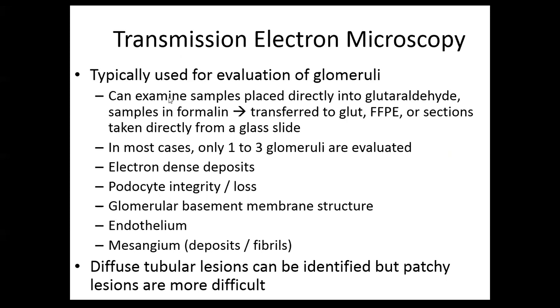Okay, but normally what happens is we send out a biopsy kit, and the biopsy kit has a little vial of glutaraldehyde, and the clinician takes a core and they cut off a cube at the end and they put it in the glutaraldehyde, and it comes to us in glutaraldehyde at OSU. What also can happen is they can submit the sample entirely in formalin, and when I receive it, I can look at it in the lab and I can take it to glutaraldehyde afterwards. So I can post-fix in glutaraldehyde.